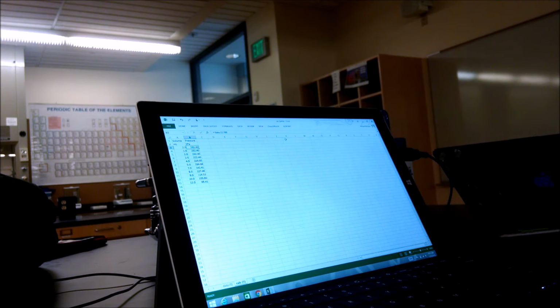Okay, now what? In Calc 1, insert a marked scatter chart of pressure versus volume. Okay, let's try highlighting all this stuff and see if it works, and if it doesn't, we'll do something else. So we want a chart, and we want a scatter with these dots.